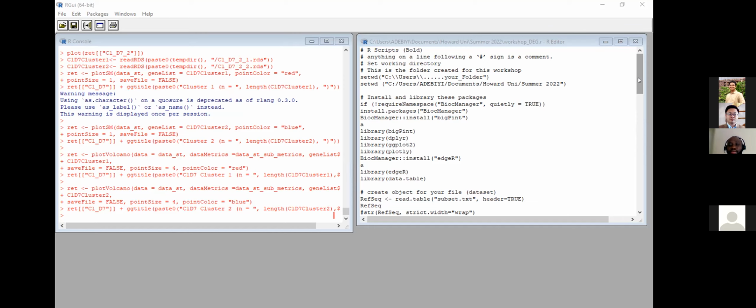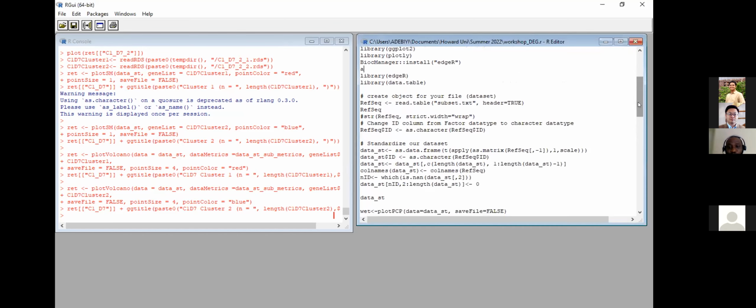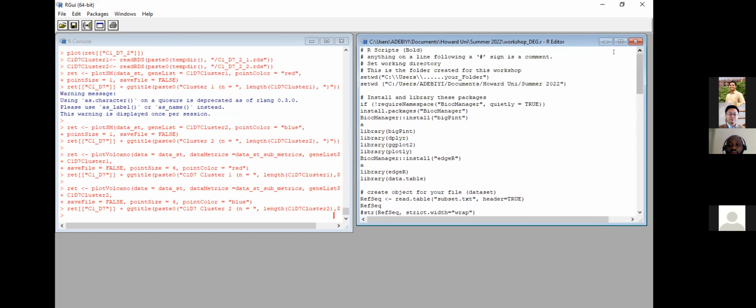You're welcome. And so the error basically came when I typed in RefSeq with read.table. Okay, so that was the only part where I encountered errors. Oh, so this part. All right. Okay. So the first thing you want to do, Rashid, is in the beginning, I did give out this command setwd, which is set working directory. So the folder where you have all these files stored in, you should be able to provide a file path for that folder, like I did.